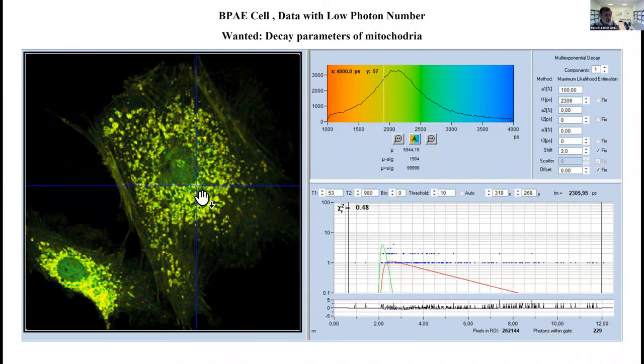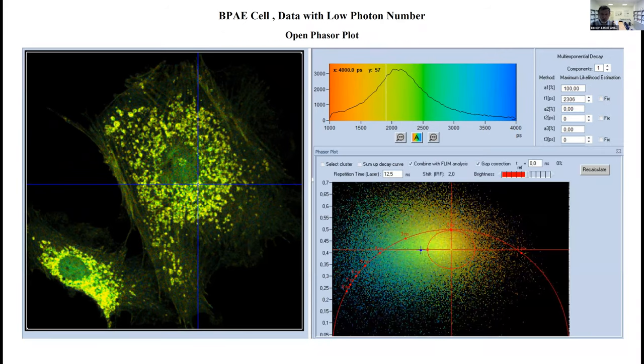How can we use it? Here's an image of a cell. Let's assume we're interested in the fluorescence decay of the mitochondria, but our photon number in the individual pixels is terribly low. What can we do? Load the data in the phasor plot. Select an area in the phasor plot which approximately corresponds to the color, that means the decay time, of the mitochondria in the time domain image.